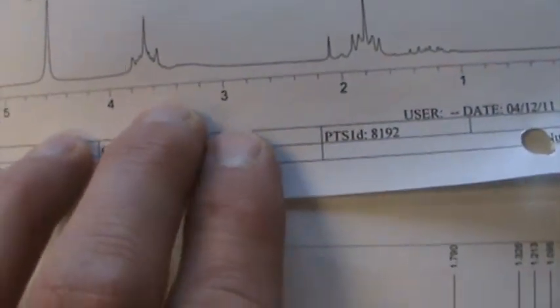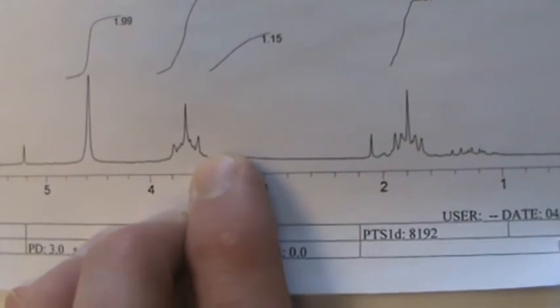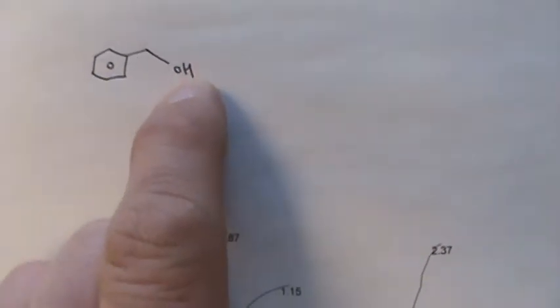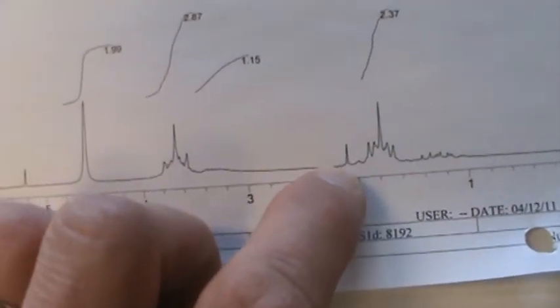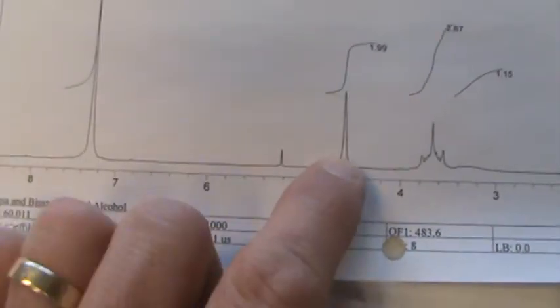Clearly, you can see the tetrahydrofuran that's left over. And then we see this, see that broad peak right there? That could easily be, and it did integrate to almost 1 in their case, the hydrogen that was on the oxygen. What that little peak is past 5, don't know. The little peak at 2.1, is that a touch of acetone? Maybe some other stuff here that's not recognizable. So obviously what we're really looking for is the CH2 at 4.6, and a nice big 5 hydrogen singlet right at 7.2 or 7.3. So let's look at other students.